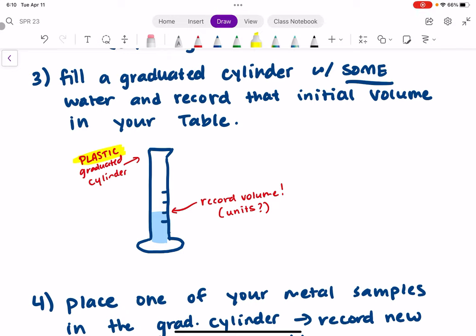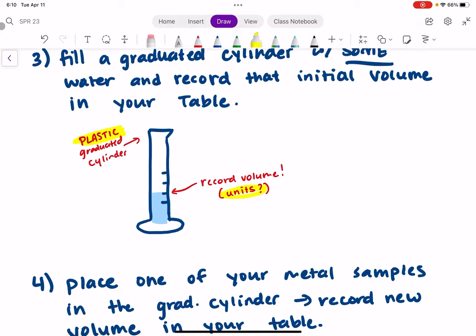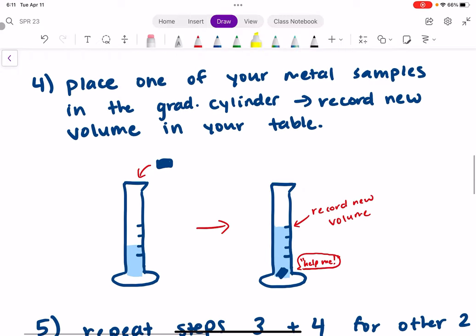Record your initial volume in your table, and I'm going to leave it up to you to figure out the units for that. Think about what units you would use to represent that.